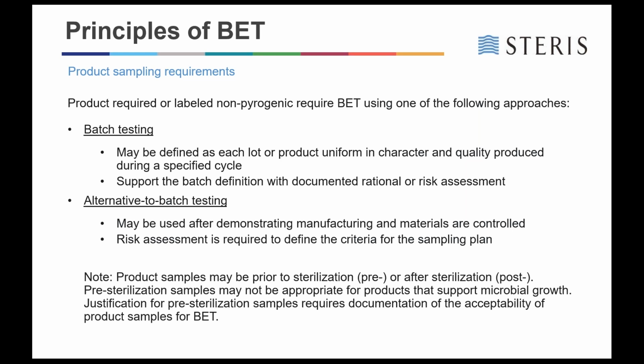And we would like to note here that your samples can come from either prior to sterilization or after sterilization, so pre or post sterilization. And just a note that when you're looking at pre-sterilization samples, it cannot always be appropriate. You might need to justify pre-sterilization samples. And one scenario that could be not appropriate for pre-sterilization samples are products that support microbial growth.